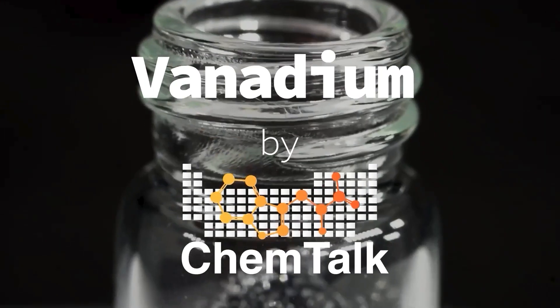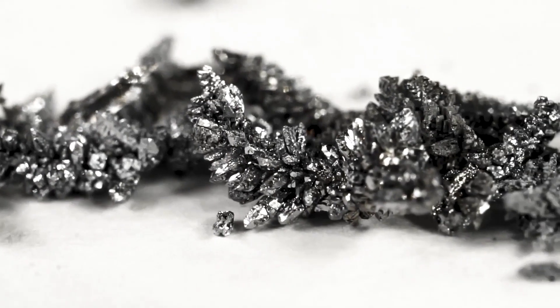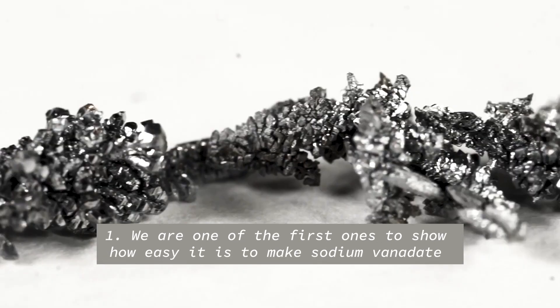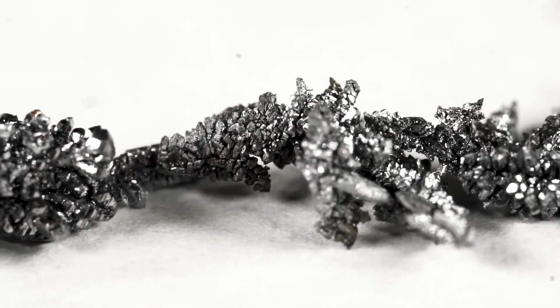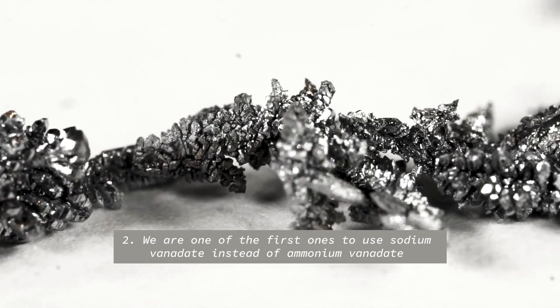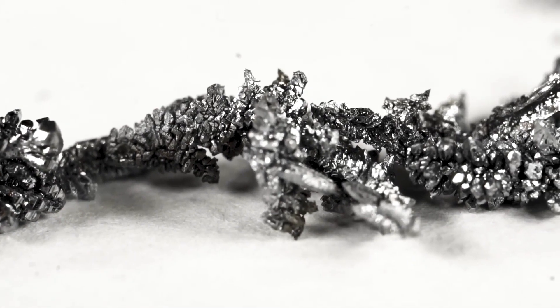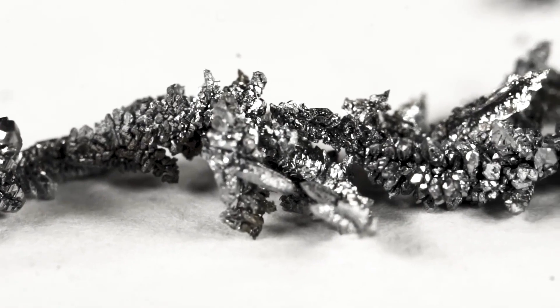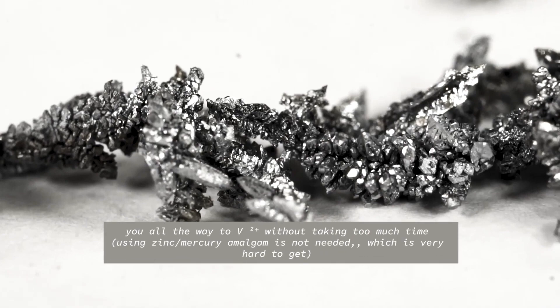What you are looking at now are beautiful crystals of pure vanadium. The crystals look multicolored in bright light due to a micro thin coating of vanadium oxides. Vanadium, a silvery metal, is the 23rd element of the periodic table. It was discovered in 1801 and named after the Norse goddess Vanadis, known for her beauty and fertility because it has such a range of colorful compounds.